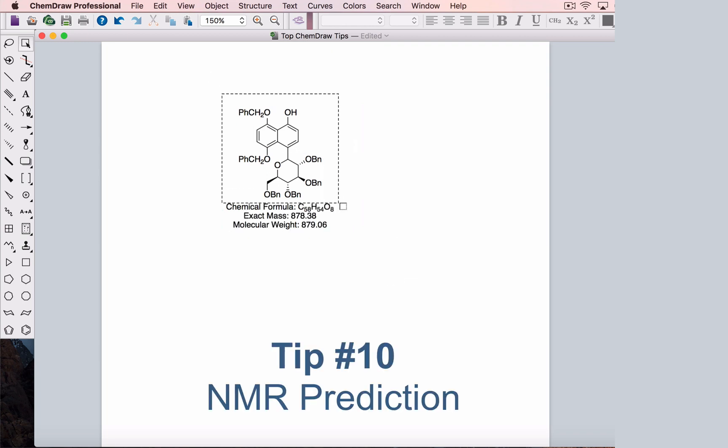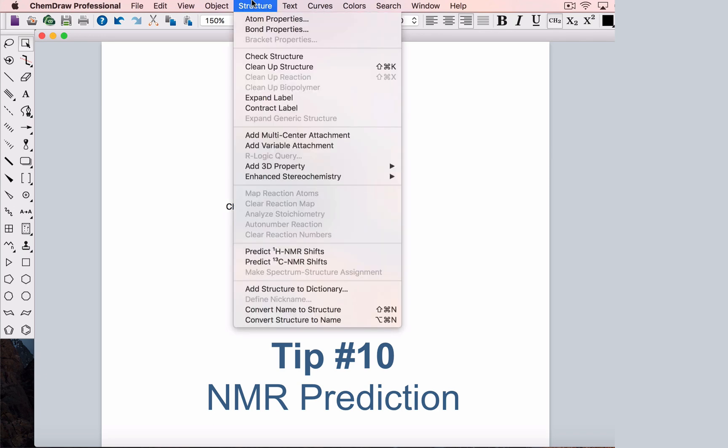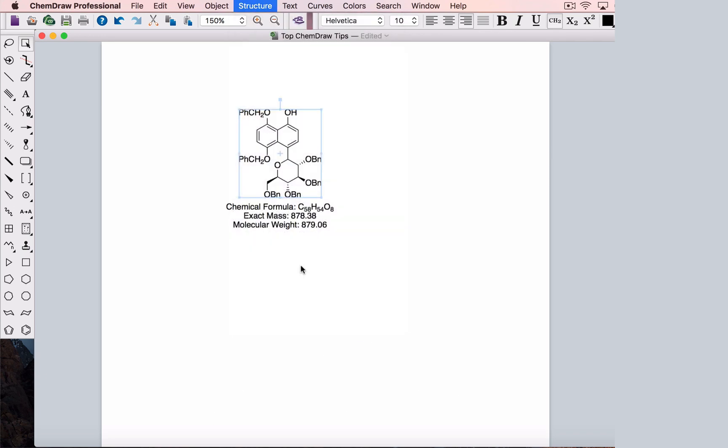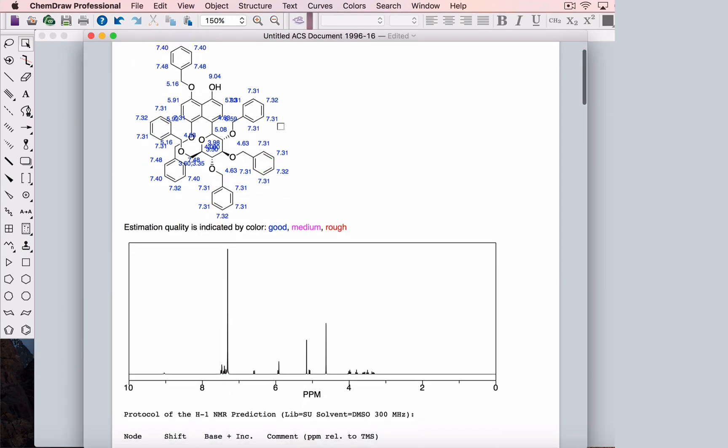Finally, wouldn't it be nice to know what to expect when we take an NMR of this compound? From the structure menu, we can generate a prediction of the NMR shifts. Now, mousing over any proton in the molecule highlights it in the spectrum and vice versa.